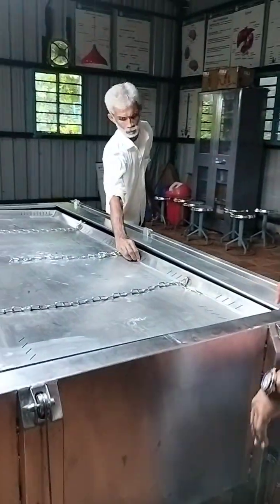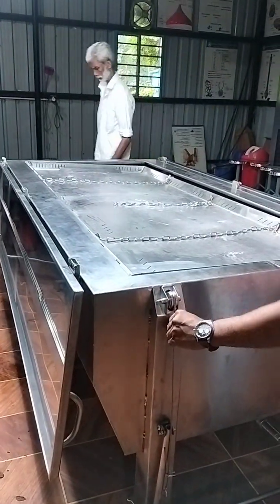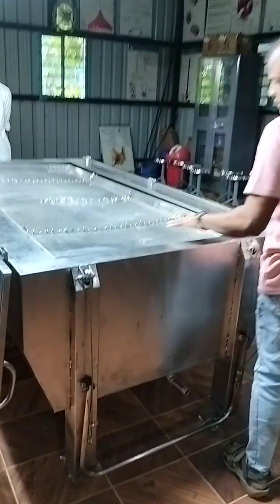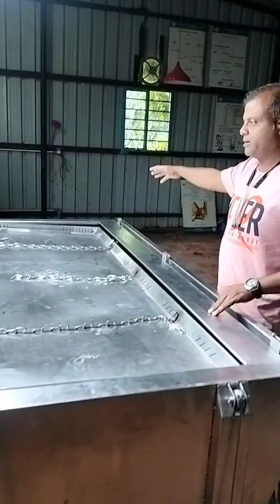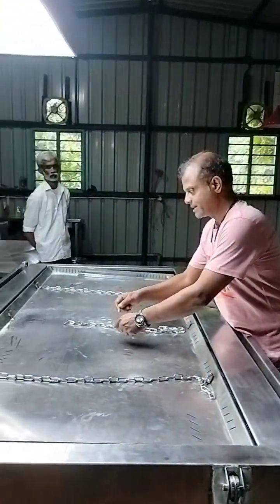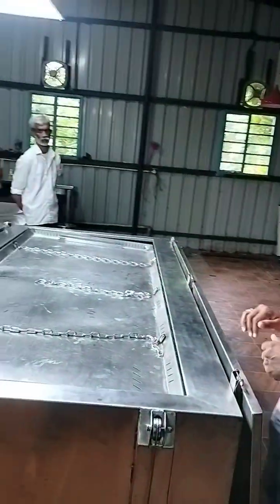And it will be ready for the new body. These are all stainless steel chain pulley systems which will take up to 250 kg weight of the body. Easily you can manage any body in this. It is 7 feet in length and 3 feet in width, so two practitioners can easily operate using this as a dissection table.